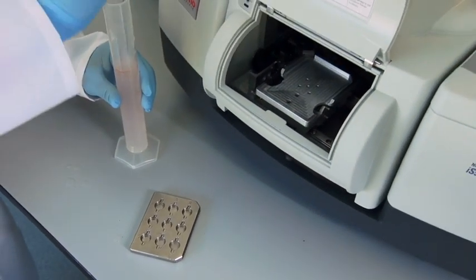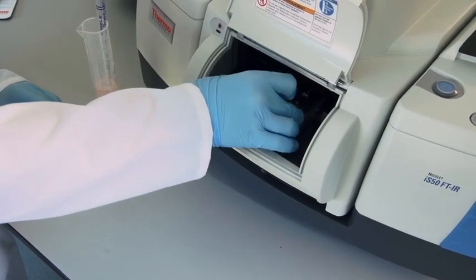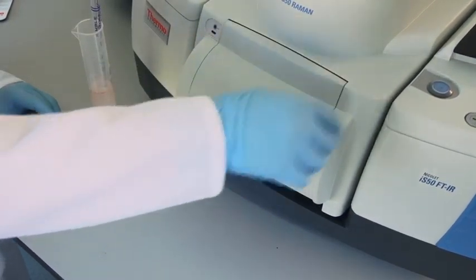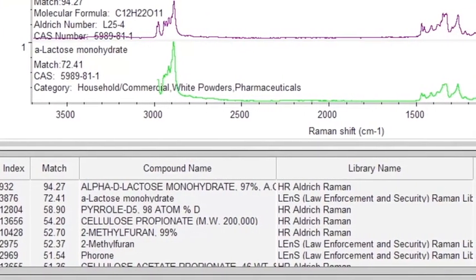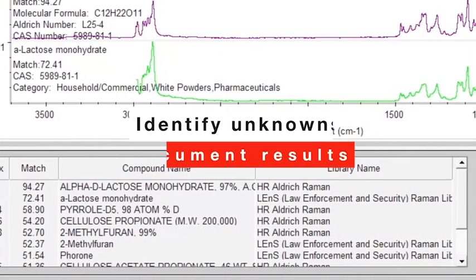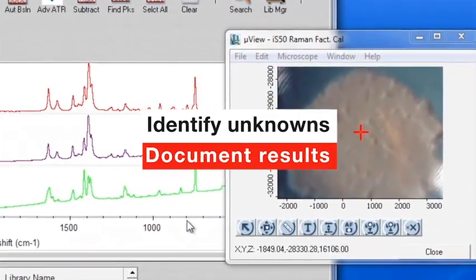The system incorporates everything you need to measure tablets, powders, liquids, and vials, or single crystals down to 50 microns in size. The Omnic software and Raman forensics library assist in identifying unknowns, while the Raman module's video capture helps document results.